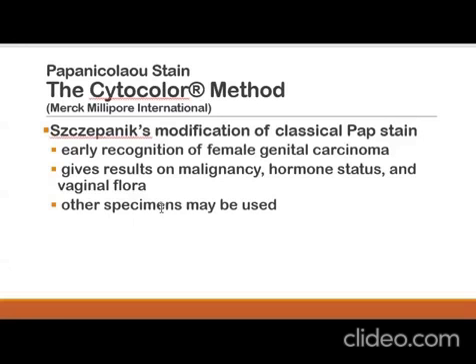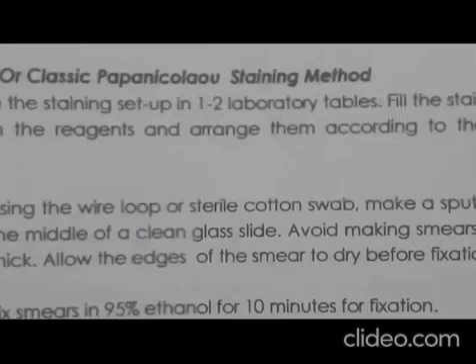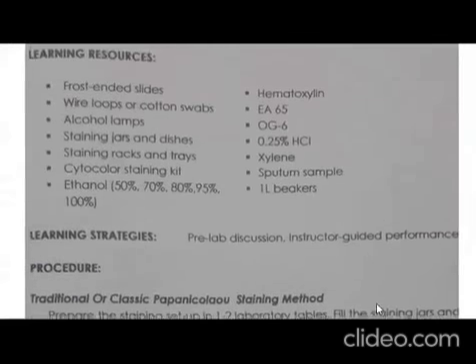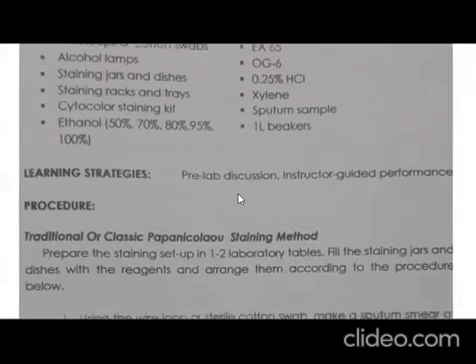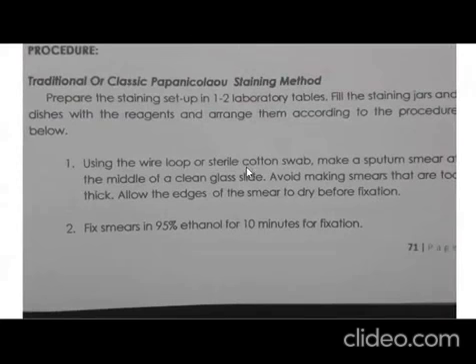So now, let us proceed with the procedure for Pap smear staining. Okay, so let's begin. Wait lang, let's zoom in. These are the materials that you need for Pap smear staining. And then, I will proceed with the procedure immediately, because this is the important part.